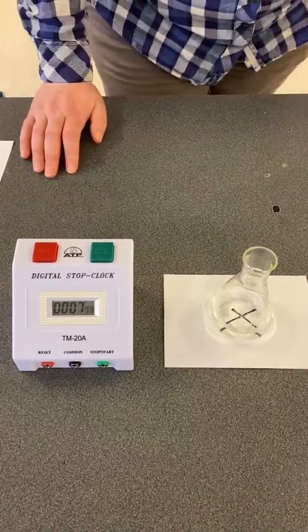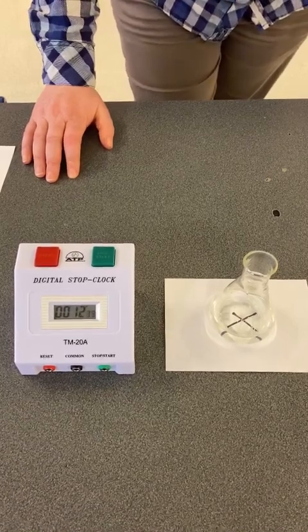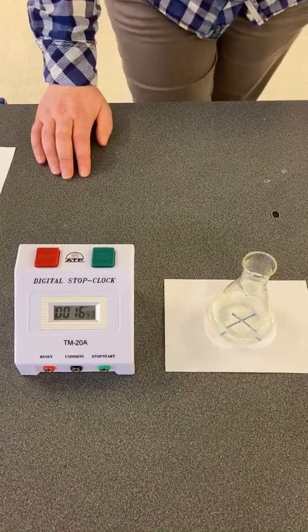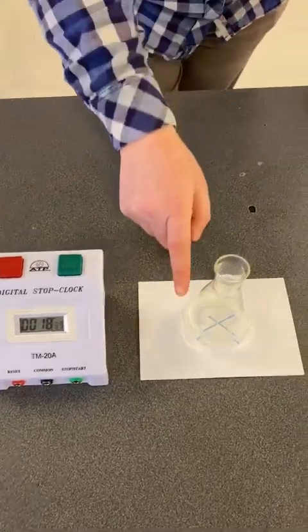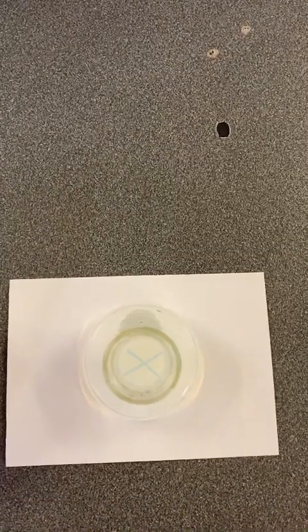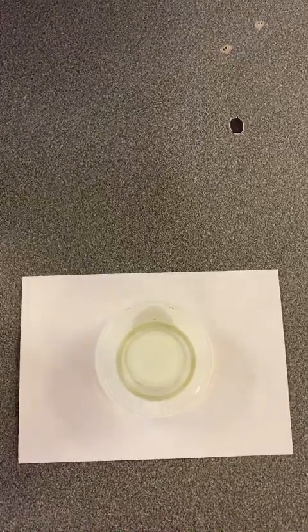When they react, they produce a solid particle, which is a yellow solid particle, and you're just about to see that start to go cloudy. You can still see the cross, but eventually it's going to get so cloudy that we can't see the cross, and then we're going to press stop.